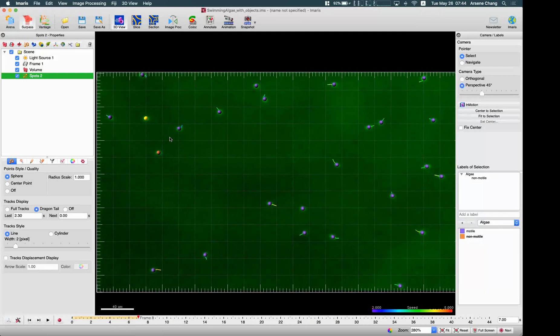Maybe just for example — if you have some fixed object, like some beads, if you have some fixed beads as a reference for the drift correction, then you can use those positions, those beads as a spot, and use that for the drift correction.